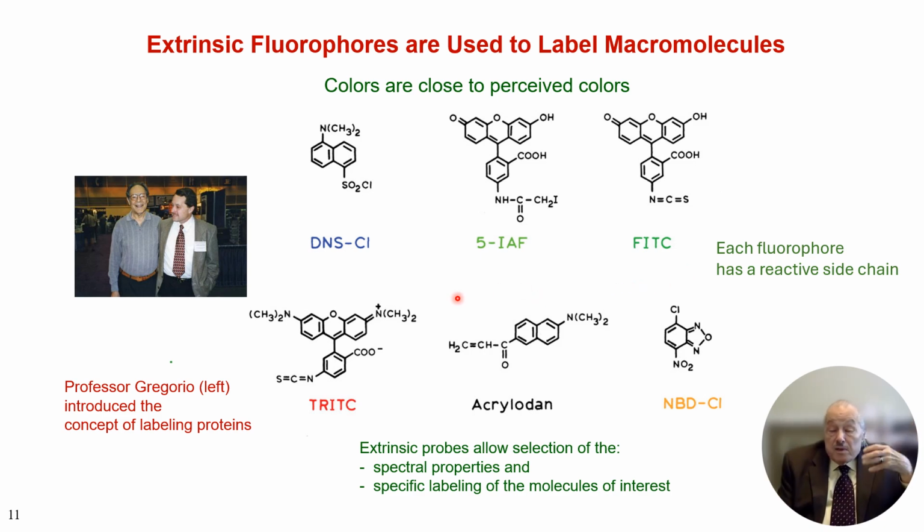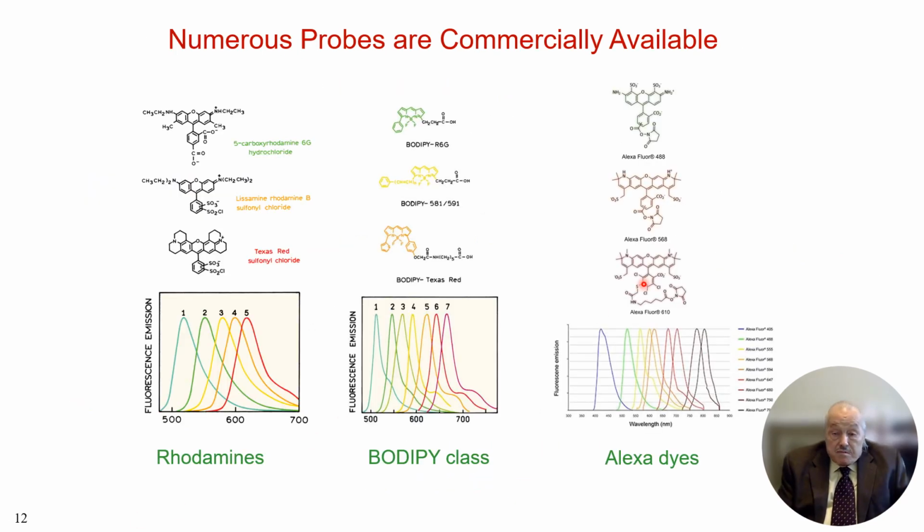So this really was the beginning of using fluorescence as a tool in biophysics to study protein structure and function.